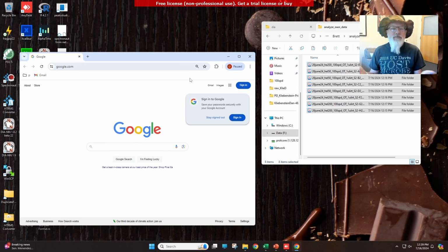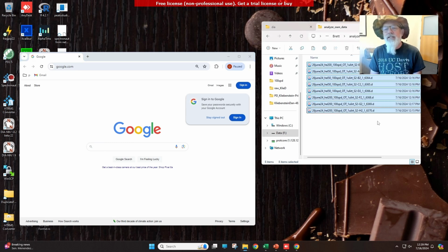So we're going to do the new version of FragPipe and then the new version of DIA-NN. And they both have new Skyline integration, so we'll go over that too. And so let's get to it. And we'll use some of the data that I generated for a normalization video, which you can find a link to in the comment section, where to download it so you can follow along.